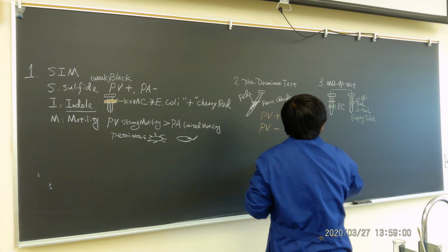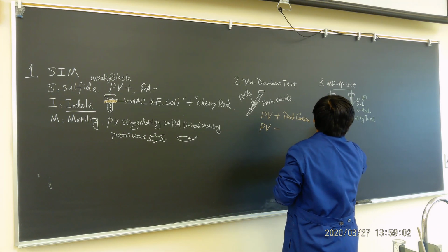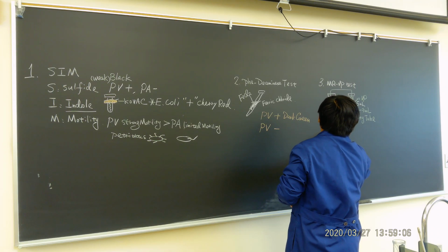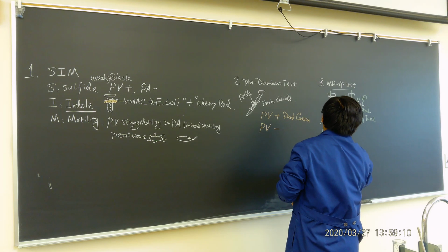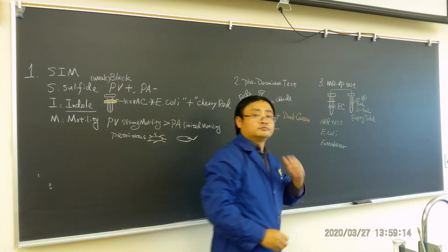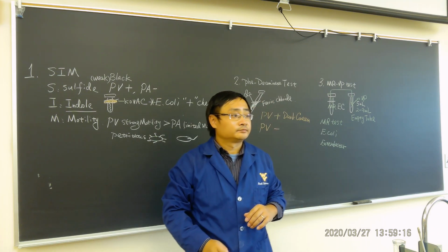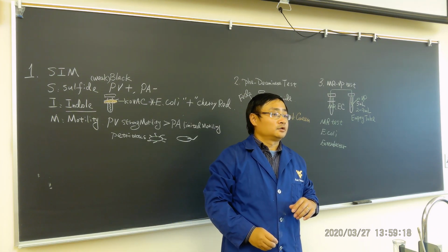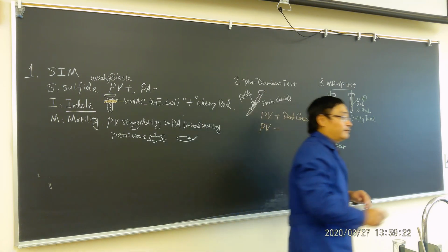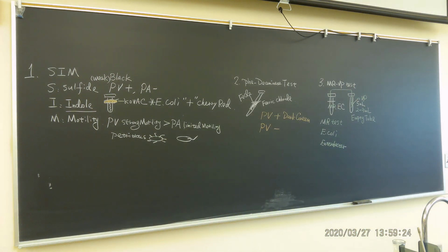Okay, so MR test. We have E. coli and the Enterobacter. Who has E. coli? Can I have E. coli? Just an example. Okay.